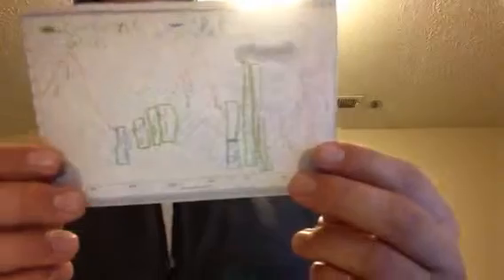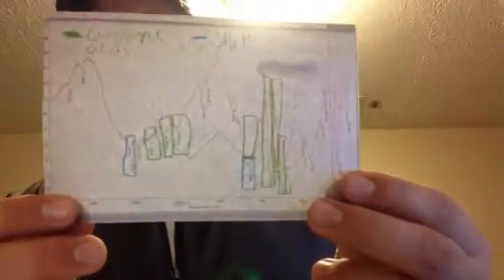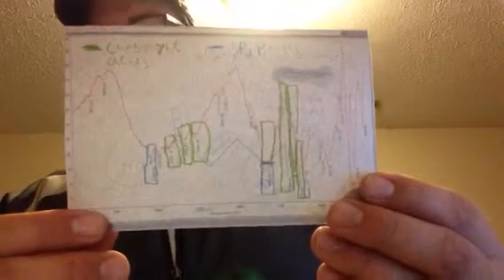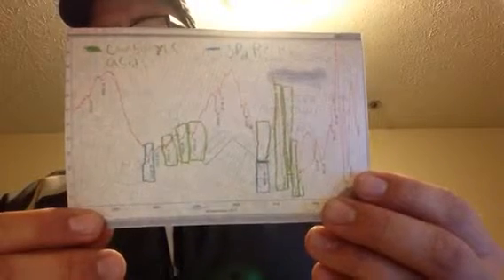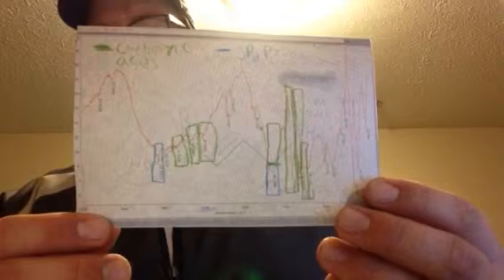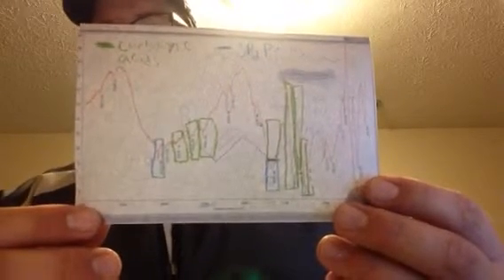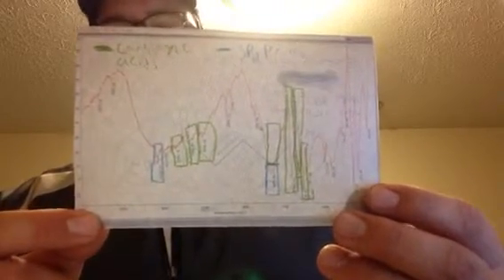For my IR spectrum, as shown here, you can see the peaks. Outlined in green are the carboxylic acid peaks, and outlined in blue are the alkene peaks, or sp2 hybridized peaks. And so that is why I selected fumaric acid as the unknown identity of AE.